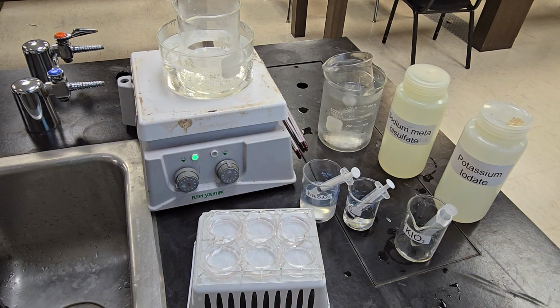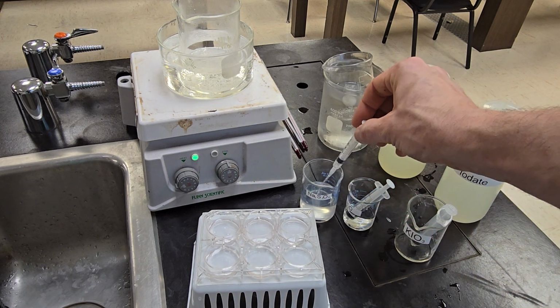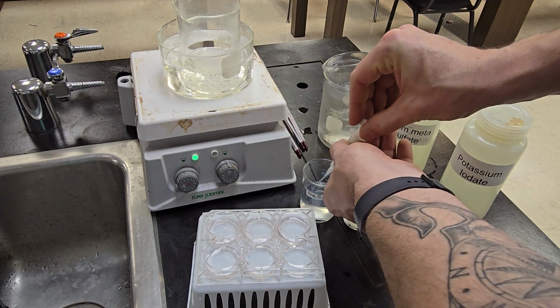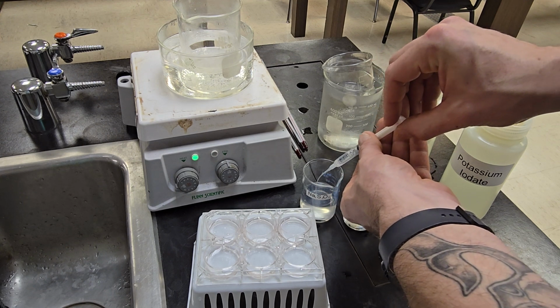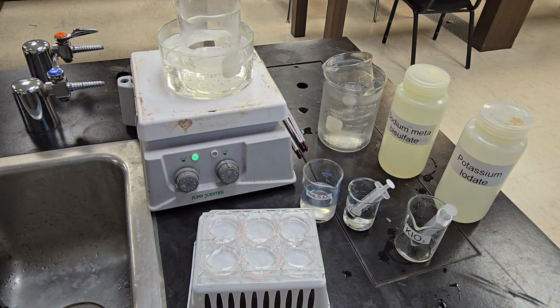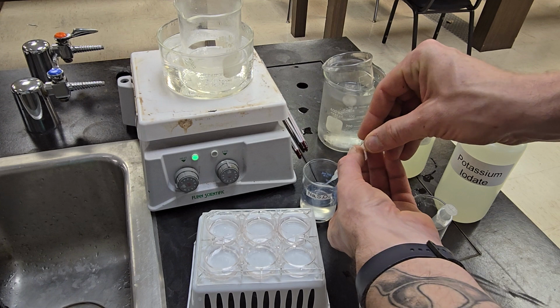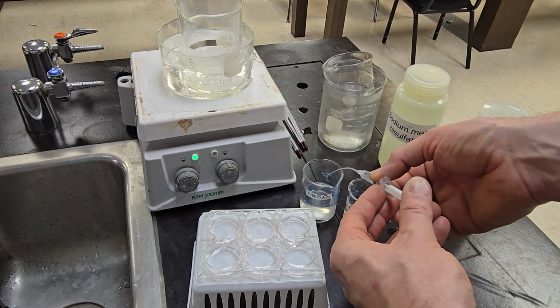Now that I've done that, I get to mix 2 milliliters of sodium metabisulfate into each well and time the reaction. For the timer, I'm relying on you to use YouTube intelligently. So you have a timeline on any YouTube video, so you should very easily be able to count the amount of time by dragging that back and forth, pressing rewind, whatever you need to do to figure out exactly how much time each of these reactions take.